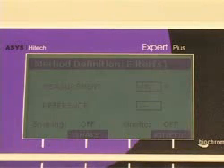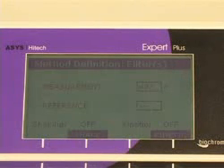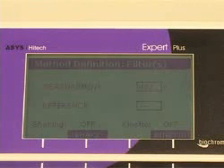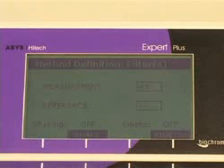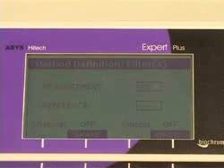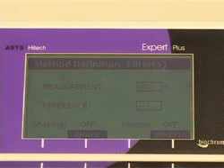The measurement wavelength is selected, along with a reference wavelength if required, from the four filters installed in the instrument. Two additional filters can also be added to the filter wheel inside the instrument for added flexibility.